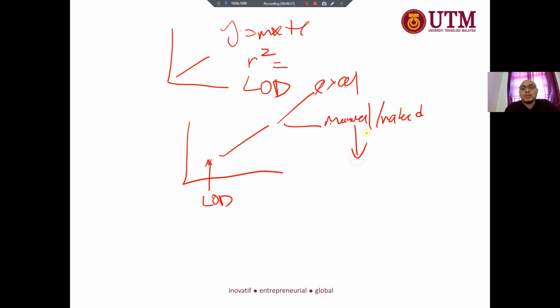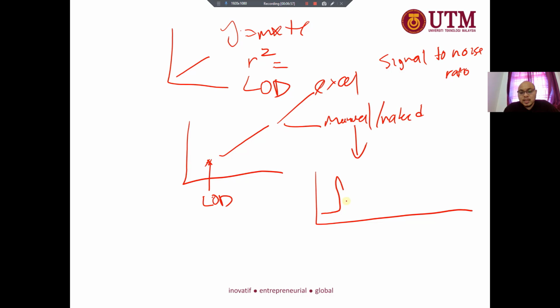Okay, how do we determine it manually? Have you heard about signal to noise ratio? When we do the chromatogram, we have the signal, and we have the noise.